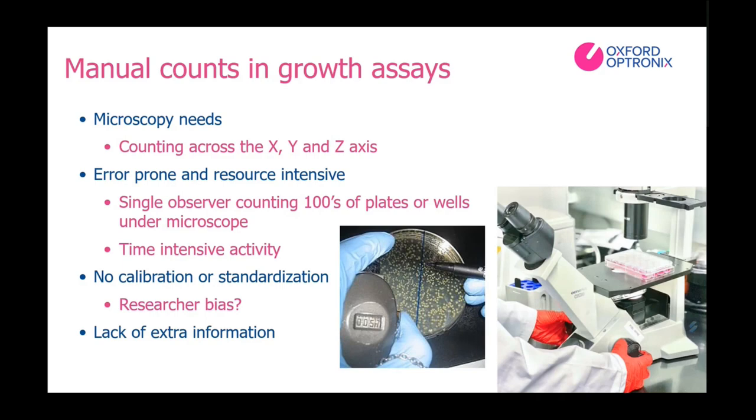If an organoid is on the borderline of being counted, is it counted or not? Is there also potential in a particularly small set of organoids that a larger one that is under the absolute minimum value is still counted? In practice, this means an error of only plus or minus 10% in the visual estimate of organoids across samples can result in massive errors of more than 50% from plate to plate. Since size can be difficult to determine accurately, this issue can contribute to large errors when counting organoids.